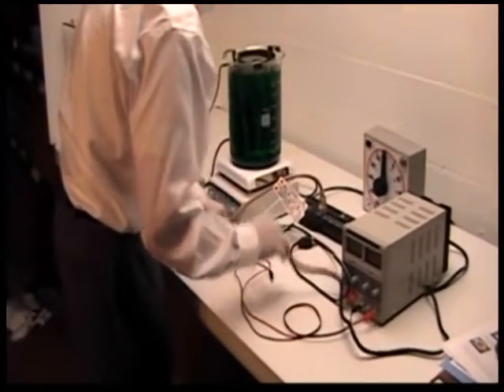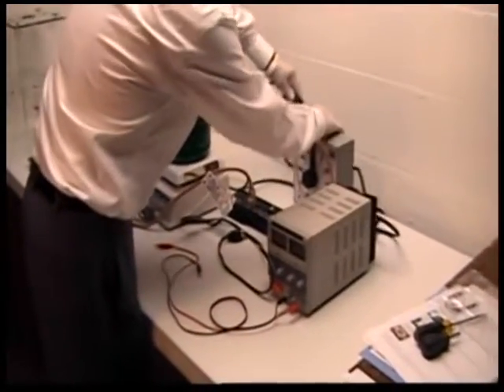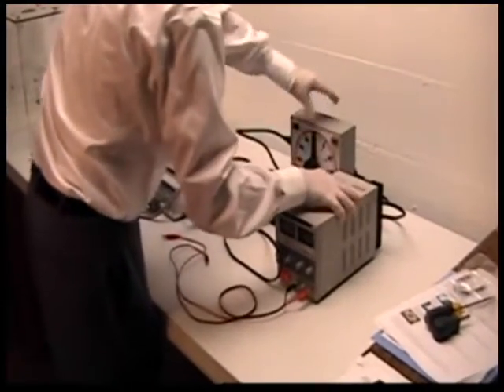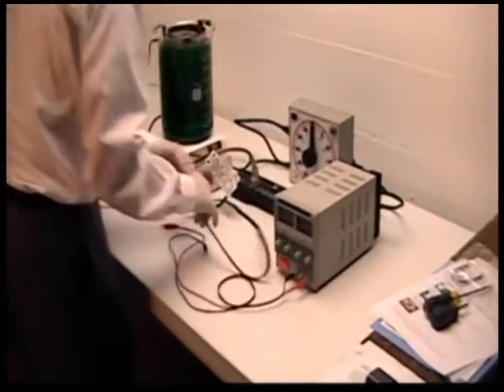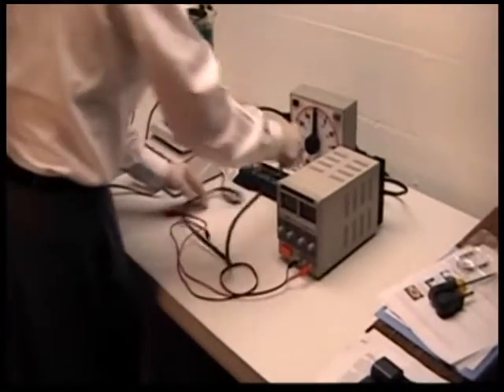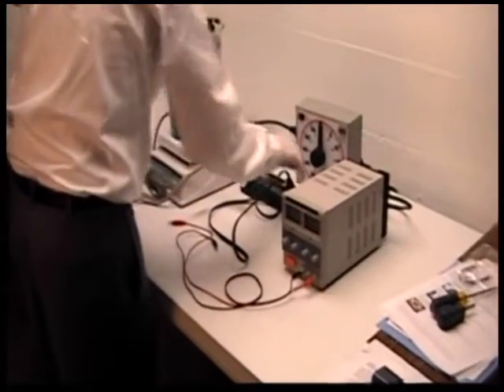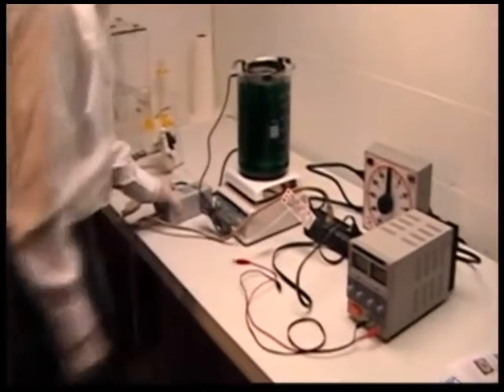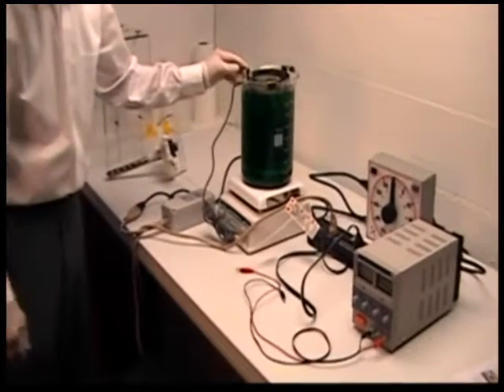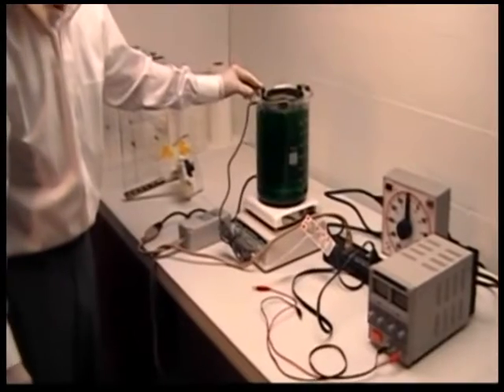At this point we'll plug in the power supply to the clock, and the clock will be plugged into the main power source. When the bath gets to plating temperature, then we'll be able to calibrate the spiral or the helix.